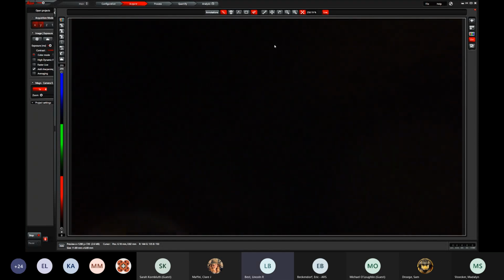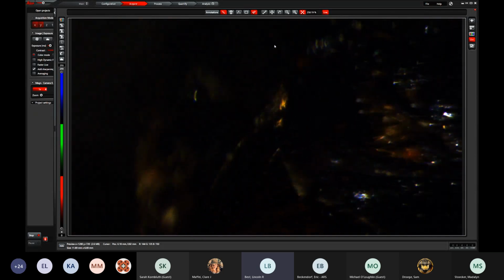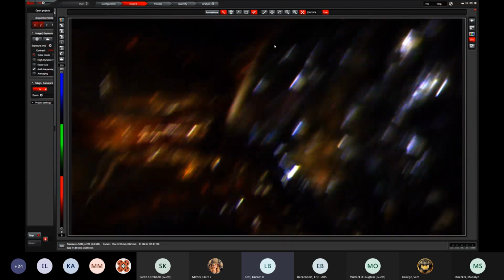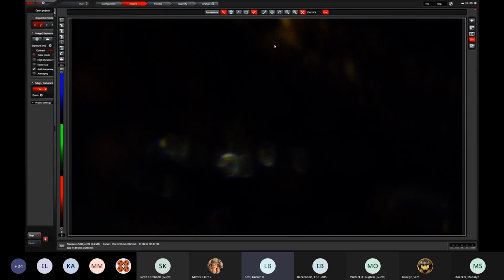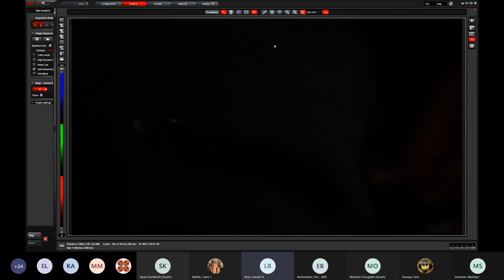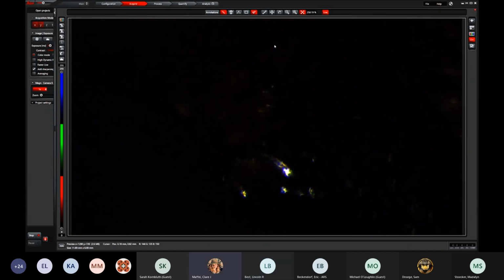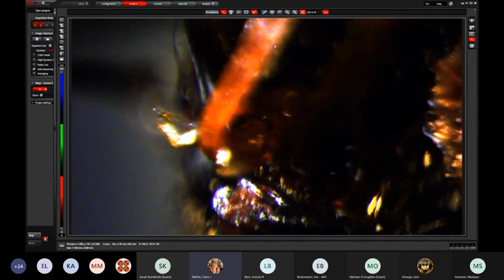Some of these characters ultimately take a lot of practice in being able to orient the specimen effectively. In this case, I took the labels off and stuck the head of the pin into some clay, and now I have to basically look at this thing upside down and backwards. We're looking at the right side mandible. We really don't see anything besides black. Oh, there we go, that's improving the situation. It'll take a moment to get enough light.